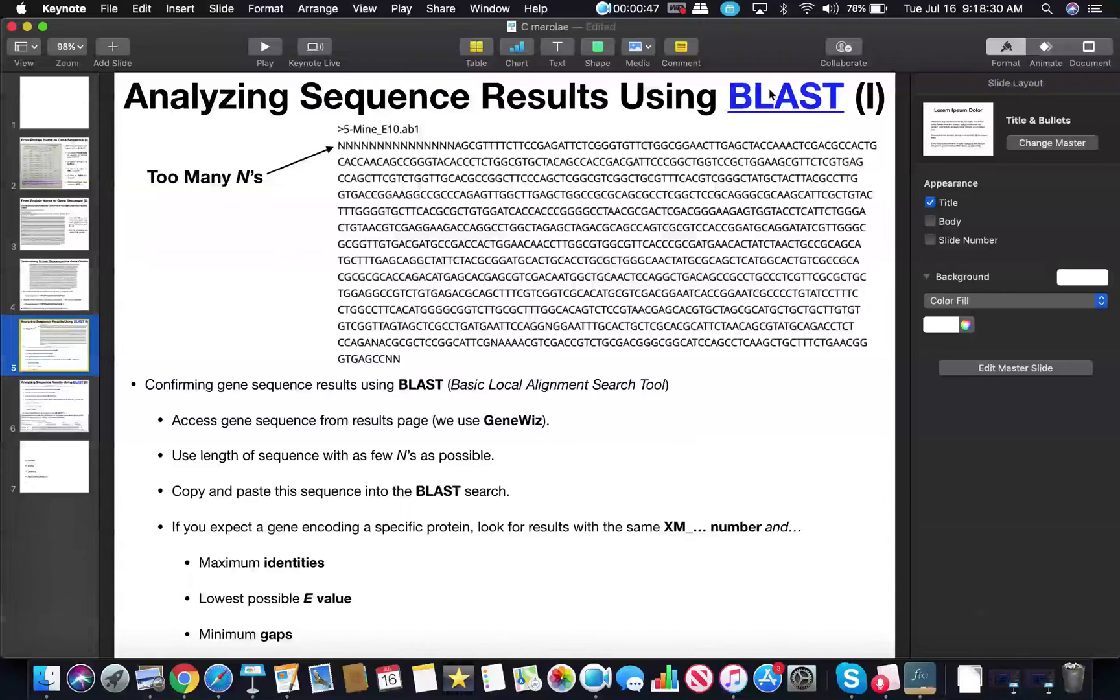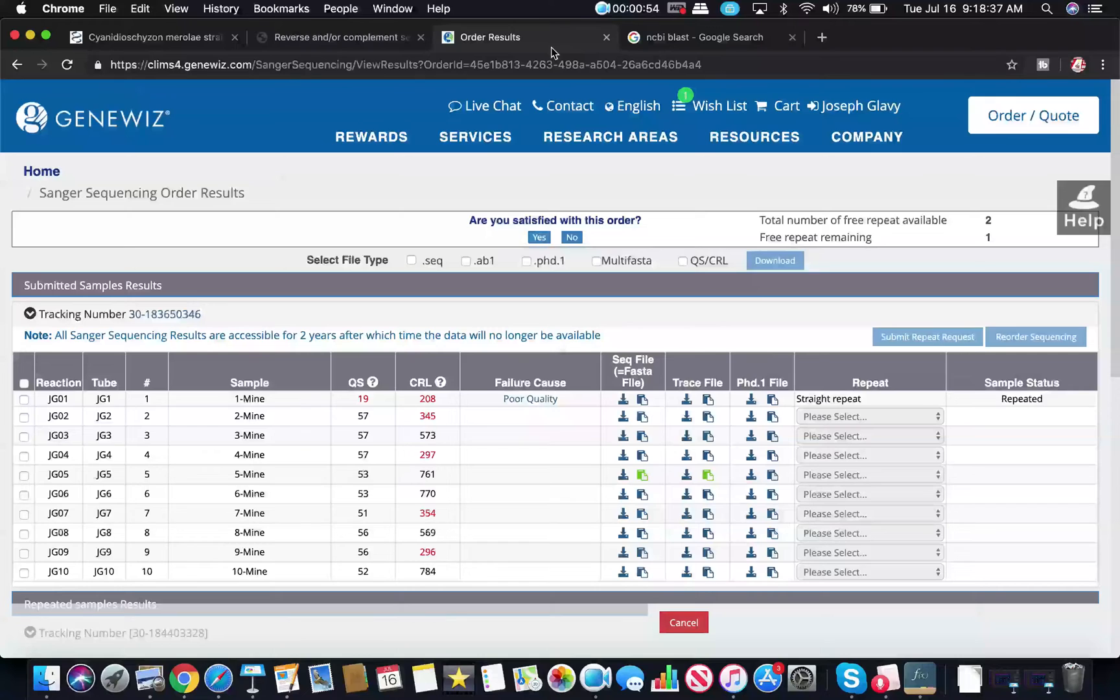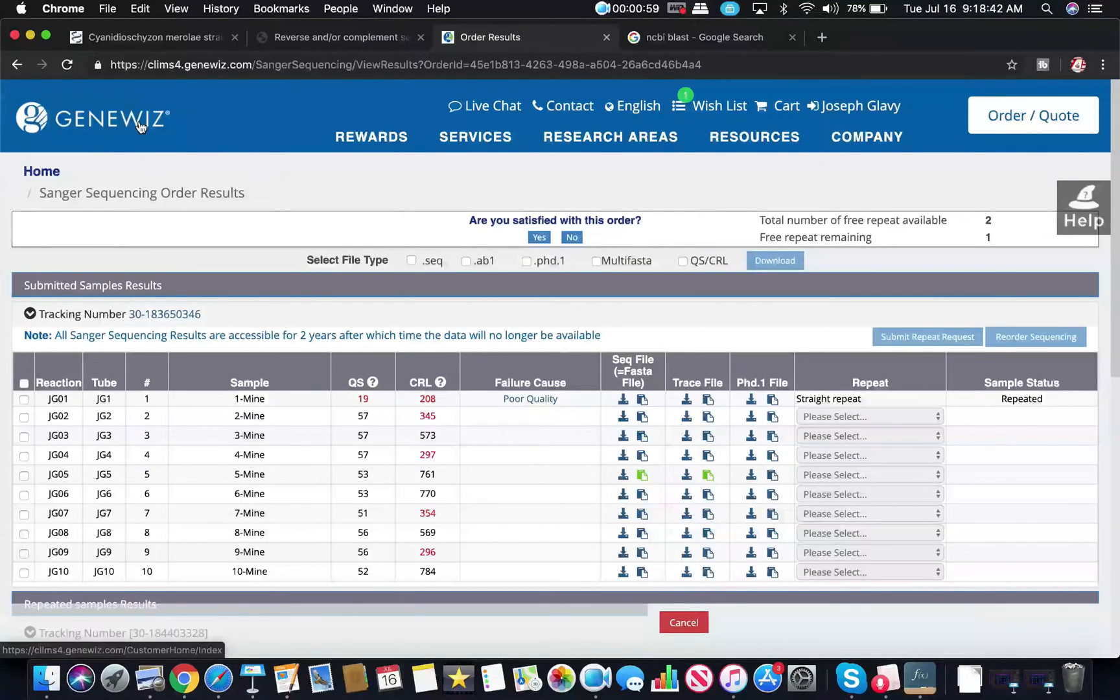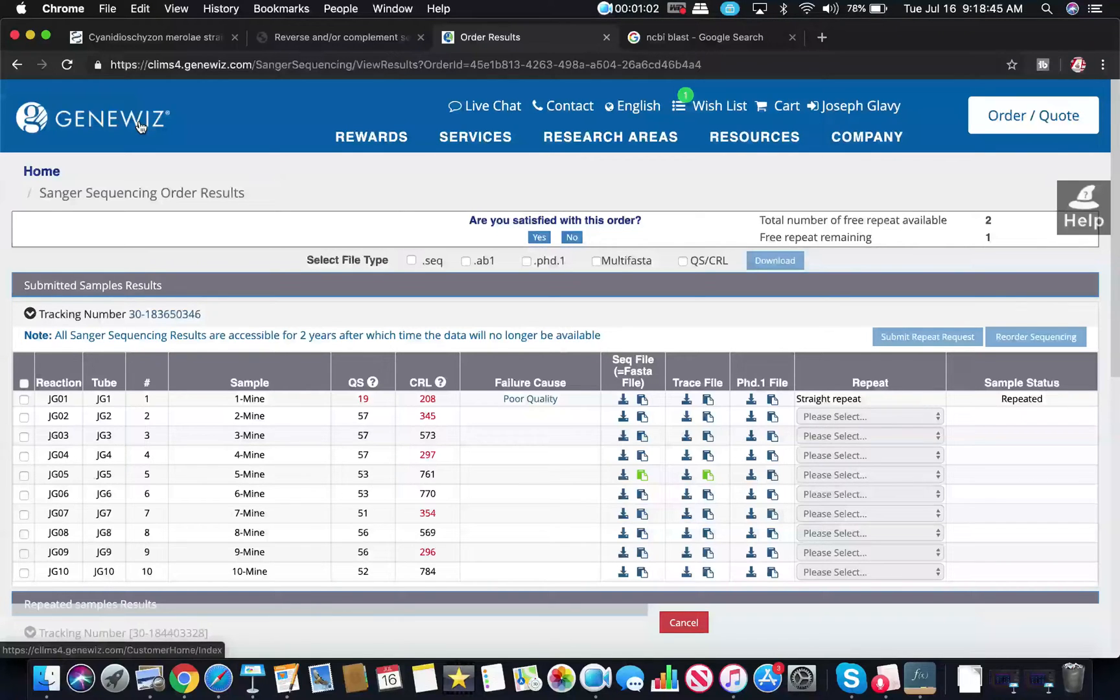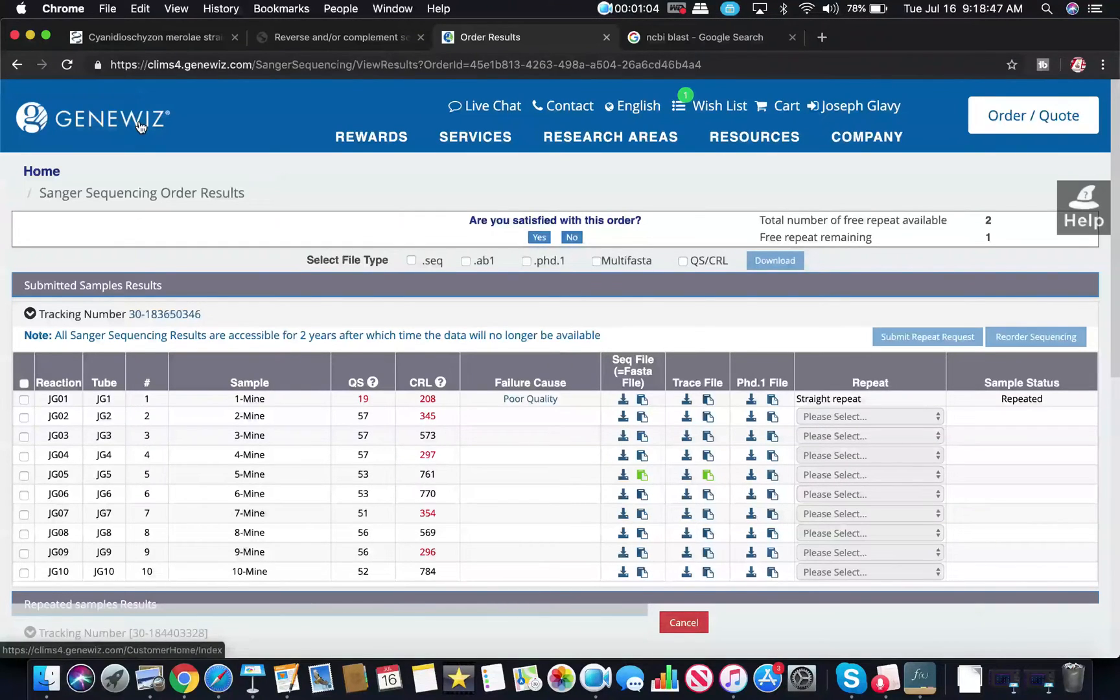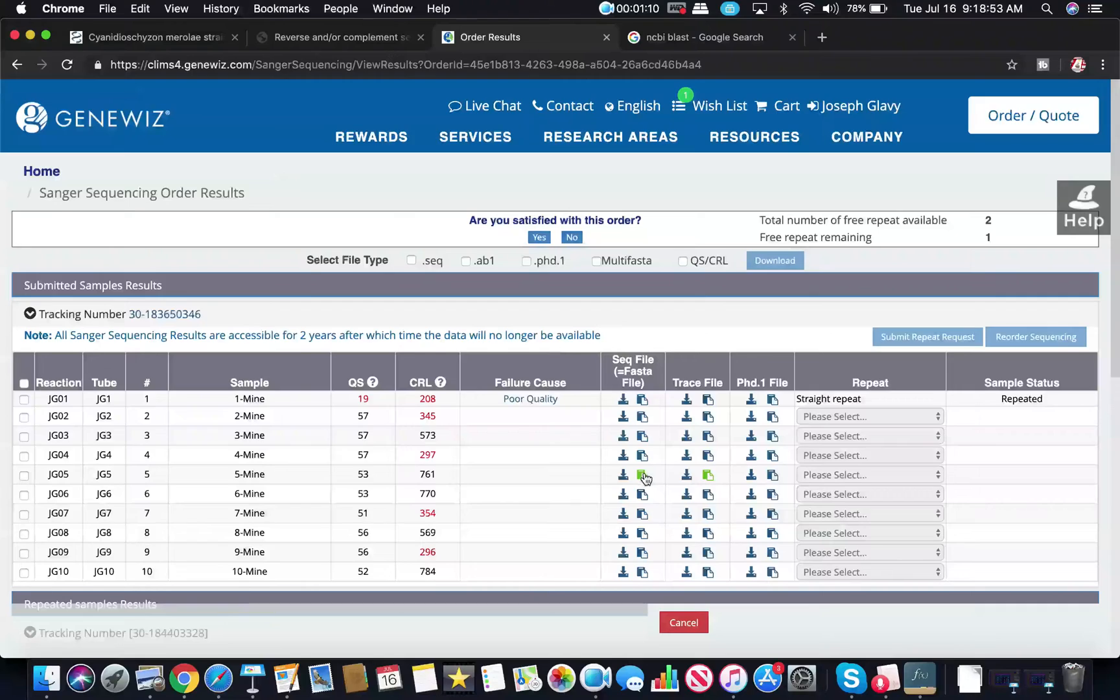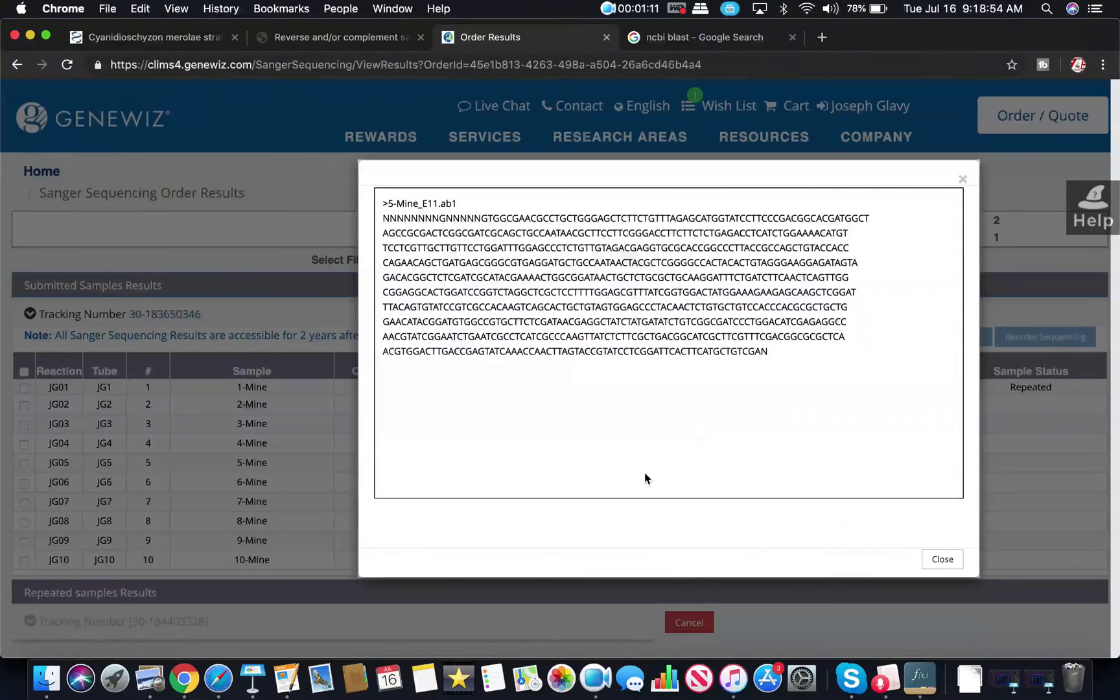Now you have to have your results of the gene sequence and where do you get those? Well everybody has a different company that they use. One very common one is GeneWiz. Regardless of which program you use, you're going to have sequence results. If you're using GeneWiz for example, you'll have a sequence file and you'll have a sequence of nucleotides that may look something like this.